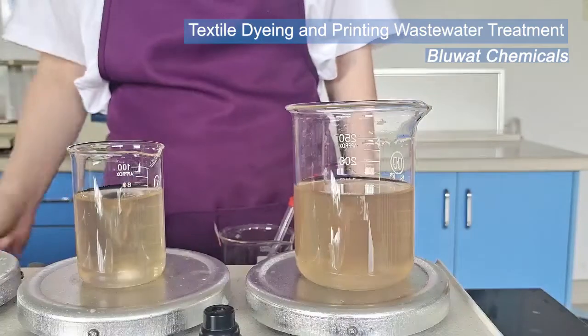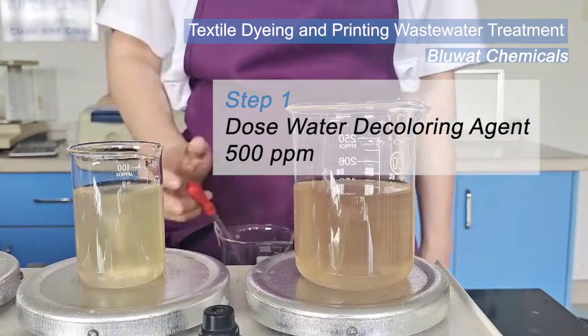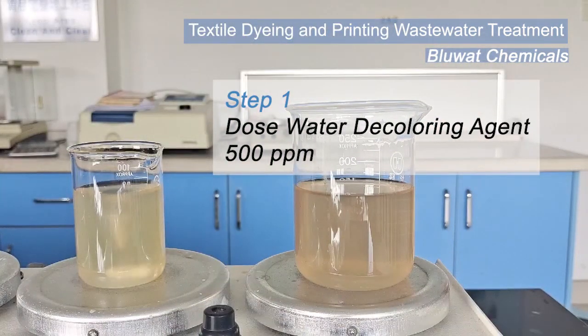Let's get started. First step: dose BWD-01 solution and mix with effluent completely until color flocks are generated.